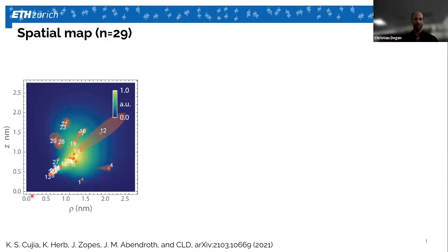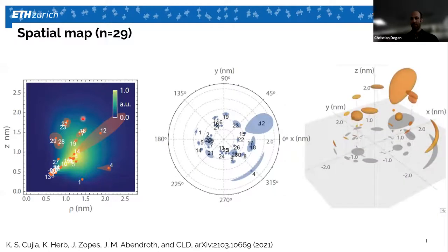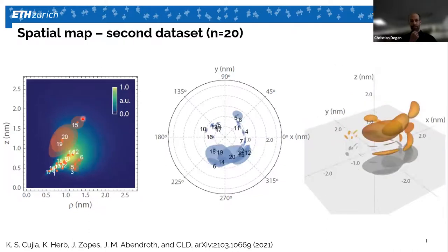So here is distance, radial distance from the NV, which would be sitting at 0, 0, and the Z distance, and the numbers are in nanometers. So you see all spins labeled here. You can also plot them in a polar plot or in a 3D way. So this will be your 3D telescope showing you where the stars are. This is one example. Here's just another example from another data set. And you see some spins are very well localized and the ones with the big error region here are not very well localized. So in essence it shows that you can do 3D distance measurement and spatial mapping of nuclei within the diamond.